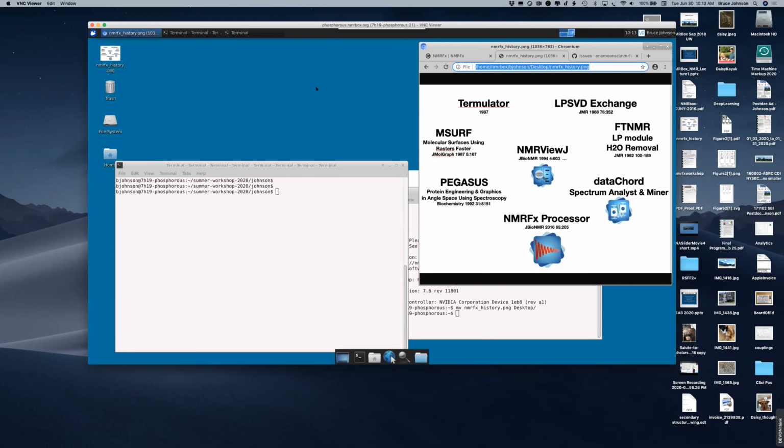So one of the first things that I do when I go to a new VM is I go up, and let me actually, let's pause for a second here and give people a chance to have logged in. If you're having trouble with that, don't hesitate to pop up and ask for help.